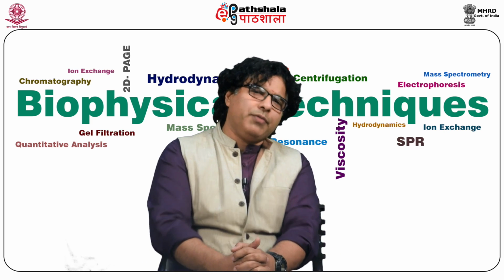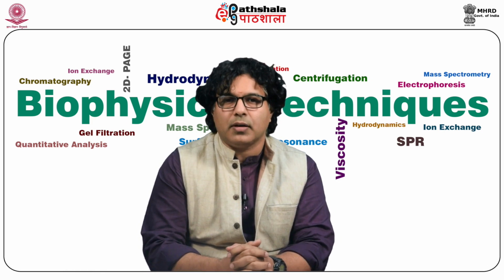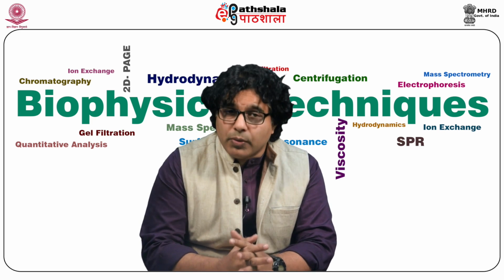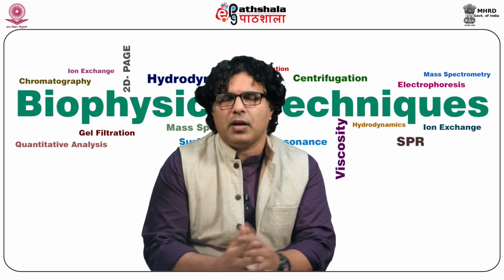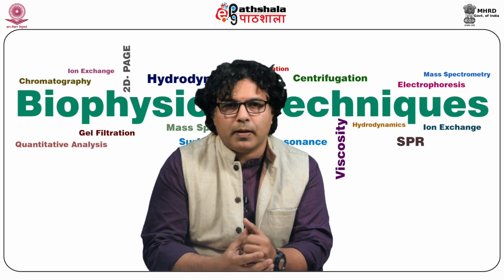So the options we conventionally have for sample preparation are centrifugation, filtration or ultrafiltration, selective precipitation, liquid-liquid extraction, solid phase extraction, dilution or concentration, or some other, such as ion exchange and immunoprecipitation.